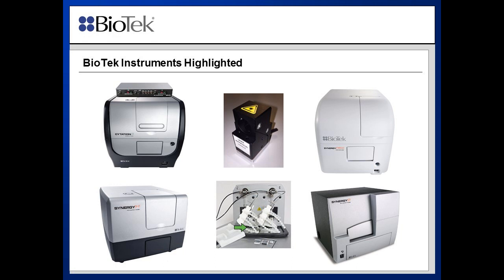The other thing I want to point out here is that for imaging, although we've only done initial proof of principle work on imaging these probes, we now have a laser cube, which really reduces photobleaching and phototoxicity effects. For this assay, especially because it's done over long kinetic intervals and repeated detection and imaging steps, the probes can be subject especially to photobleaching. So this laser cube is really a great addition for the Luxcel probe imaging.